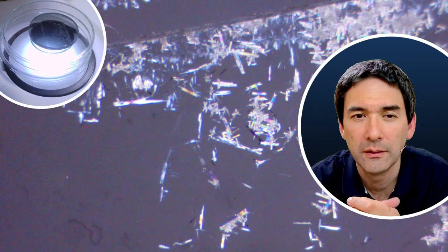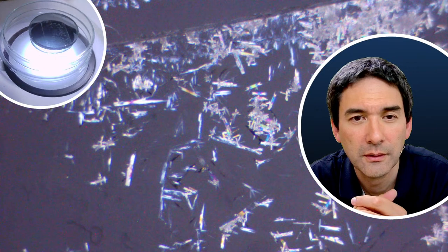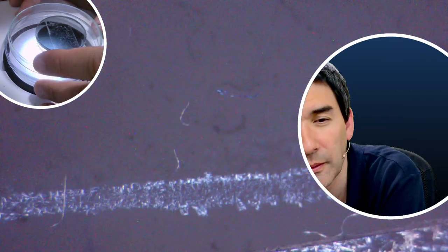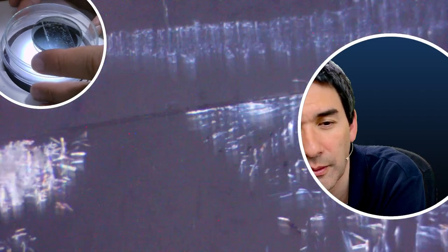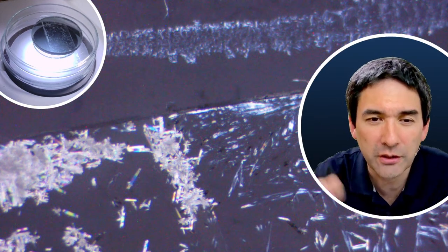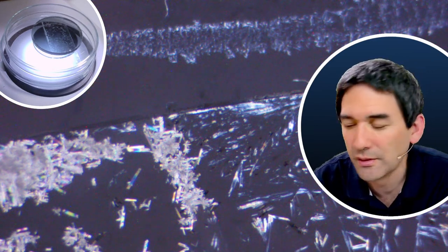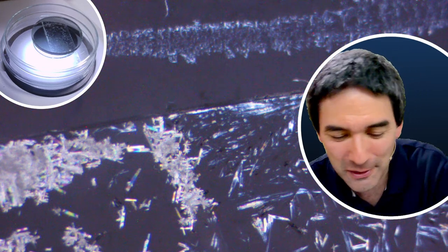Okay. But it's going. Yeah, so it's a relatively fast crystallization process. Here we go again. Yeah, the flashing that you see here is the camera kind of adjusting its exposure. Yeah, and the slide's finished. It's that fast.